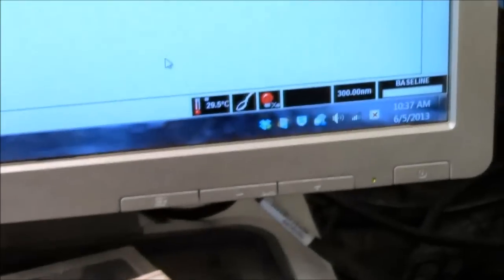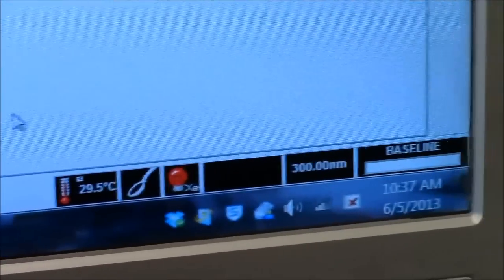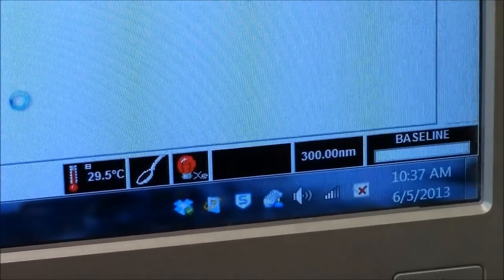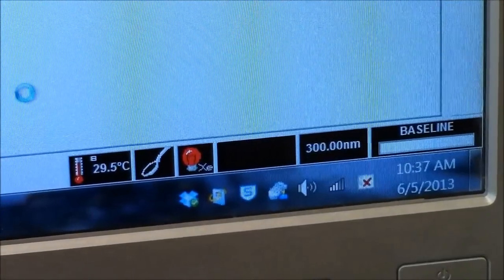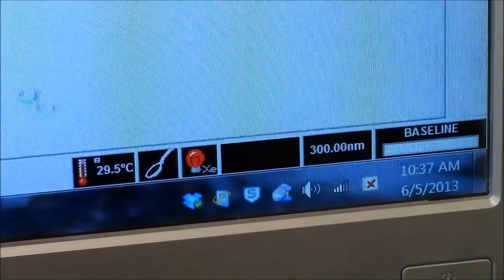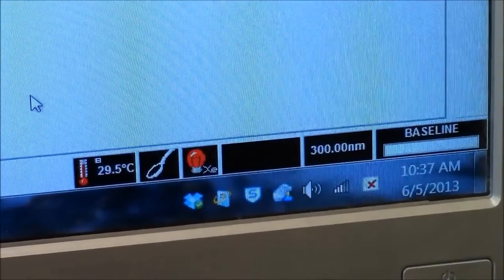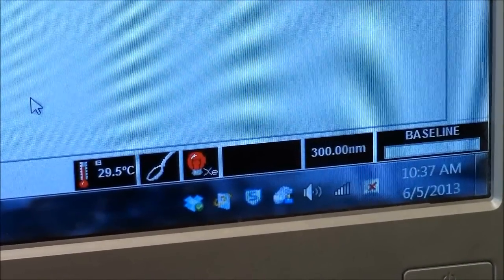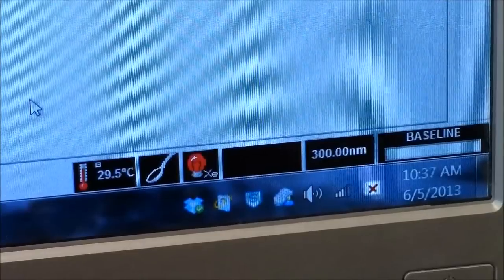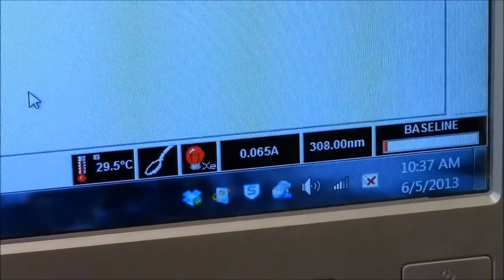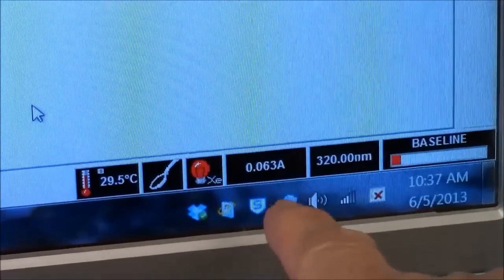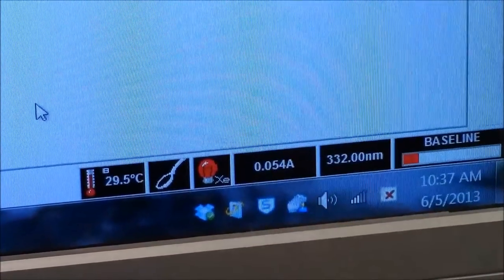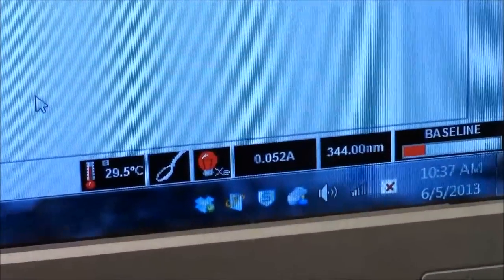Down here in the corner. It will scan. I set it to scan from 300 to 500 nanometers. And it is making all these absorbance values zero.